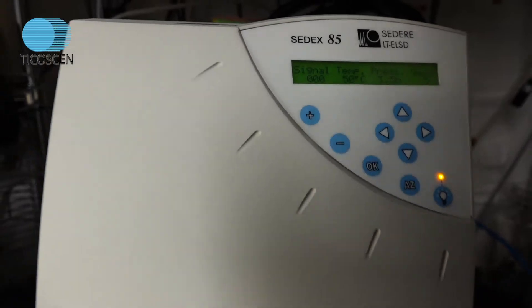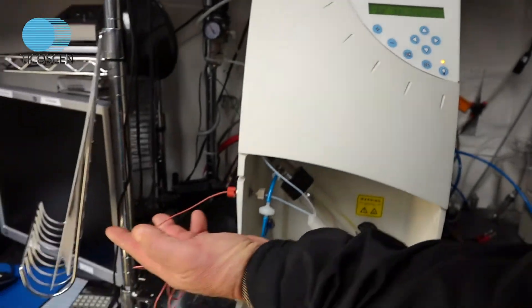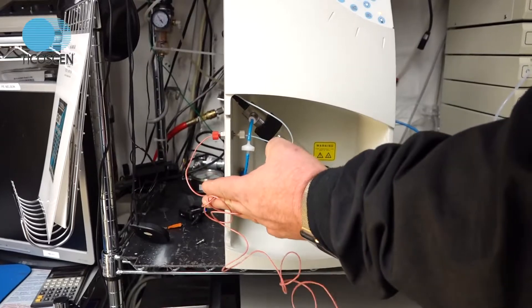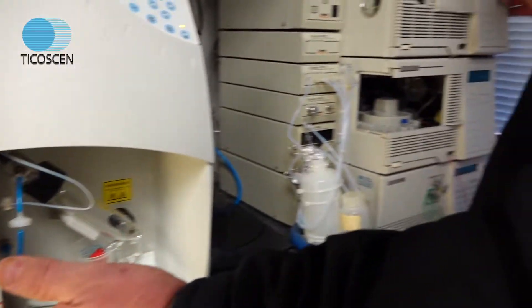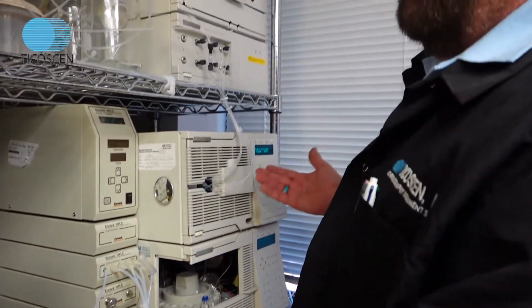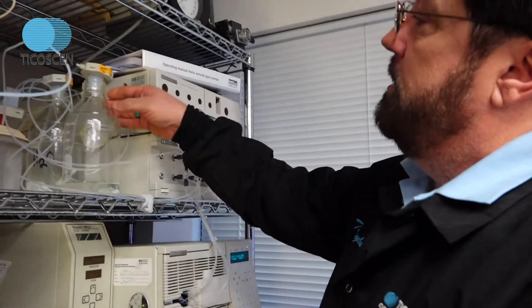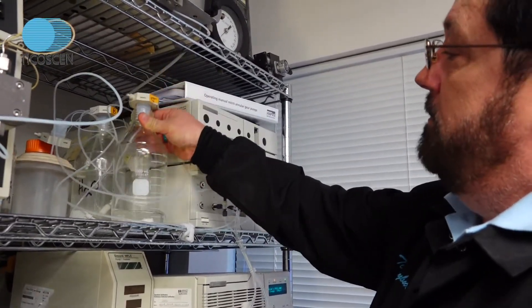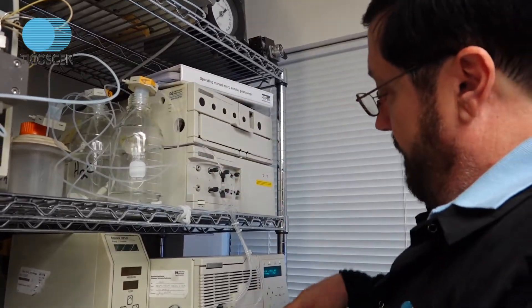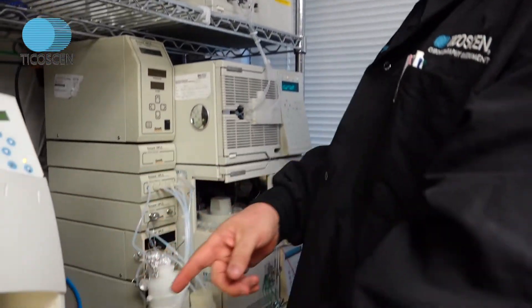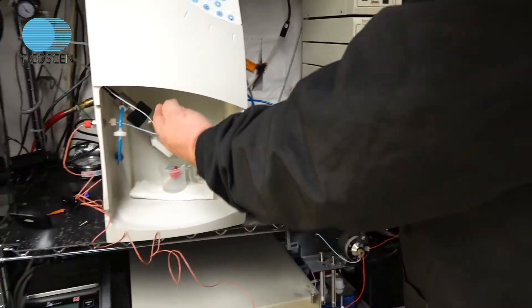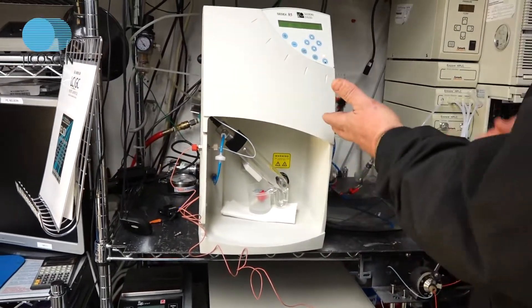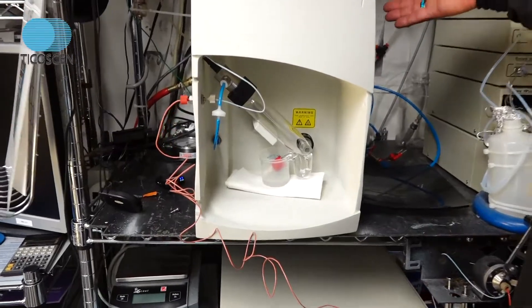Then you hook up your solvent line, which is already hooked up. You come over to your HPLC, turn your pump on, 1 ml a minute of water. Here's my water here. It's running out of this one liter bottle, and I'm pumping water through my pump, through the system, into the detector. This 1 ml a minute of water will be the source of my steam.